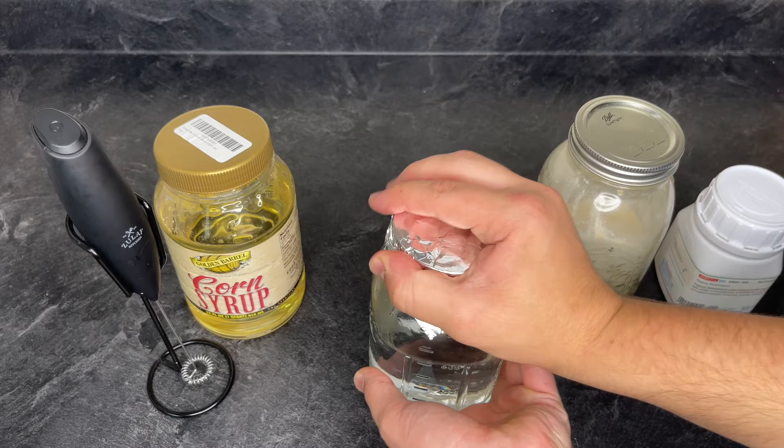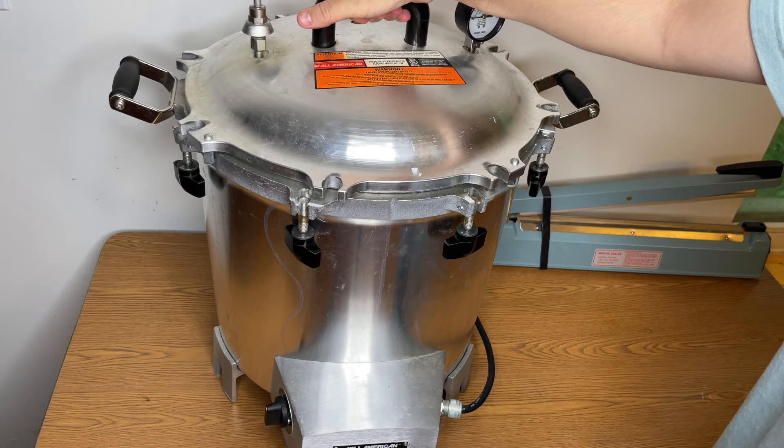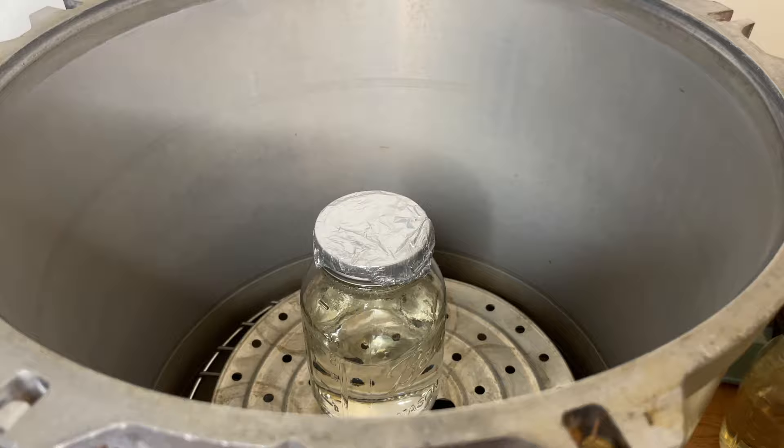I loosen the lid a quarter turn and cover with aluminum foil. The jar is then sterilized in a pressure cooker for 20 to 30 minutes at 15 psi. If you don't have a sterilizer, you can give the jar a steam bath for 2 hours in a large pot with a lid.